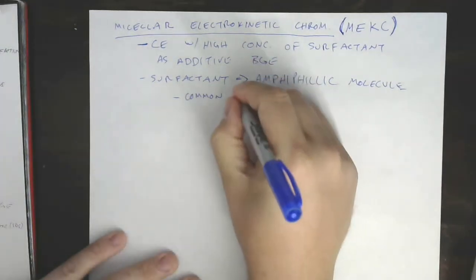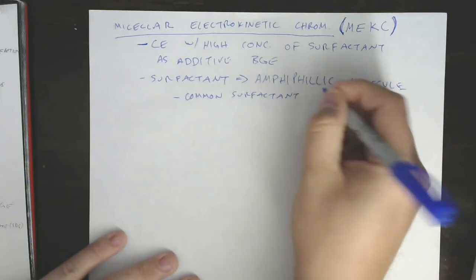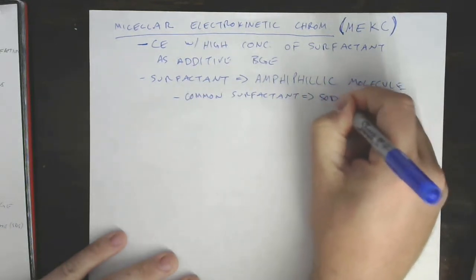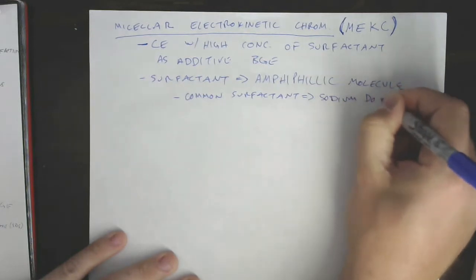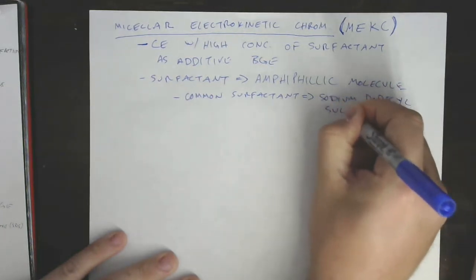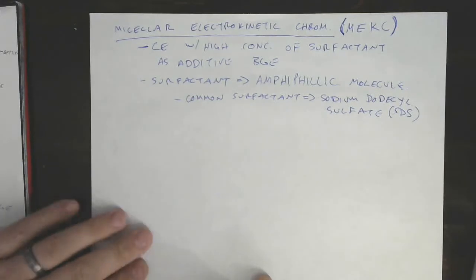Okay, so a common surfactant for this is sodium dodecyl sulfate, or SDS. Here's what SDS looks like.